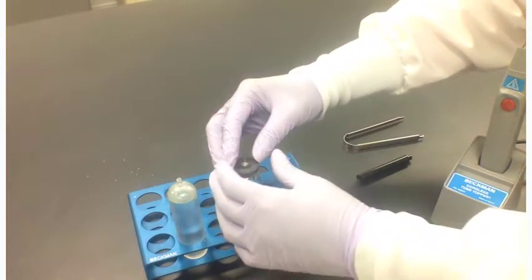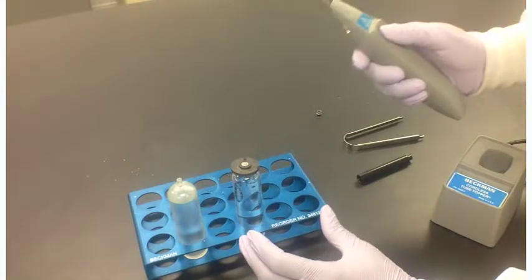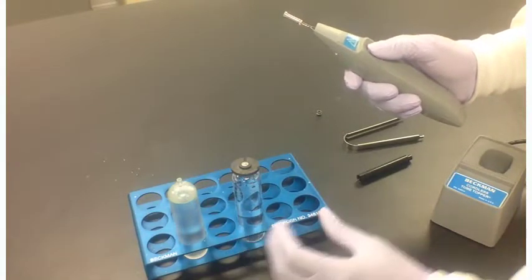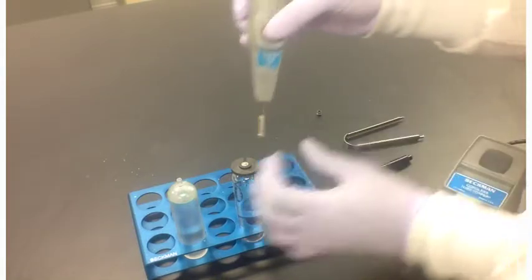Place a seal guide with the flat side down over the seal former. Turn the tube topper push button to use position. Press the push button and wait 3-5 seconds for the tip to heat.